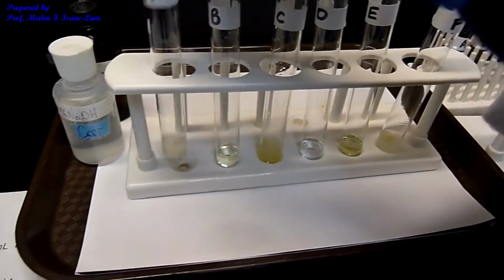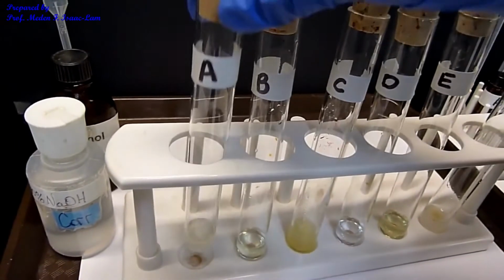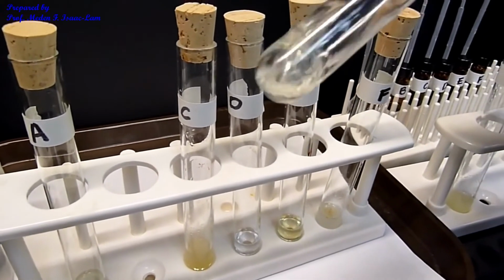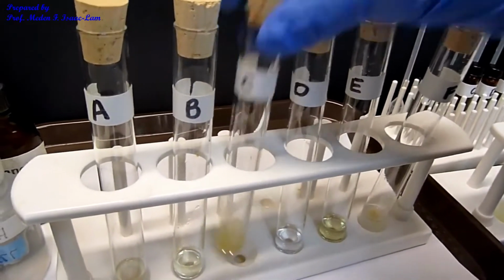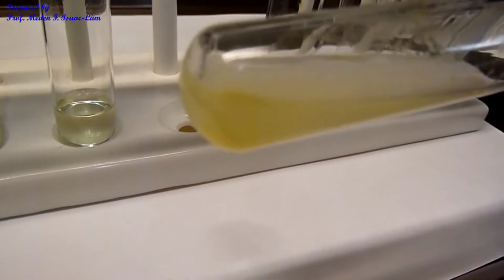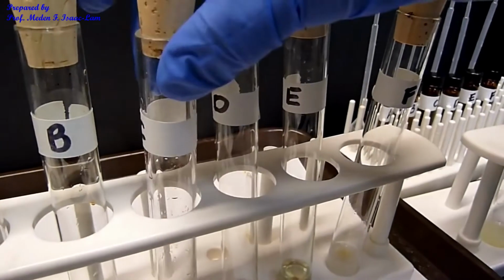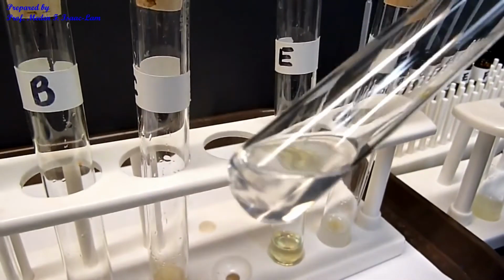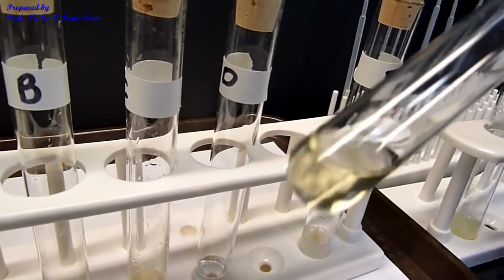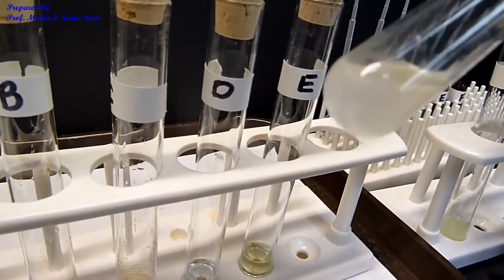And now I'm going to go back to A. So A, I don't see anything. So sometimes it's slow to react, so we might have to add another 10 drops and see how it works. Actually, if I can tilt it, you can see that there's precipitate at the bottom. And then D does not have any precipitation. It's clear, almost clear. And this one slightly yellowish but no precipitate. E, and then F also nothing.